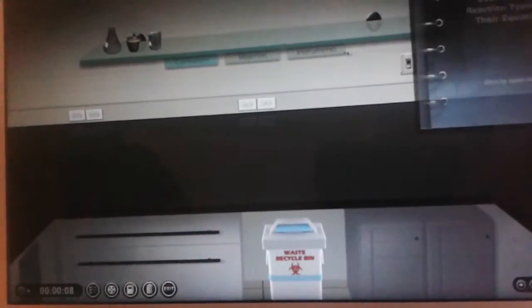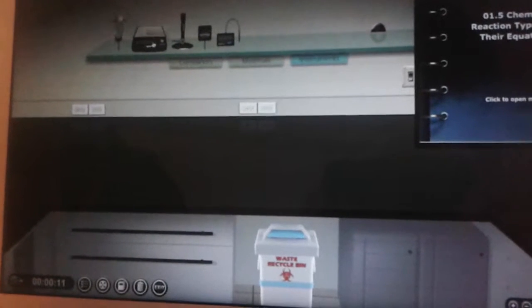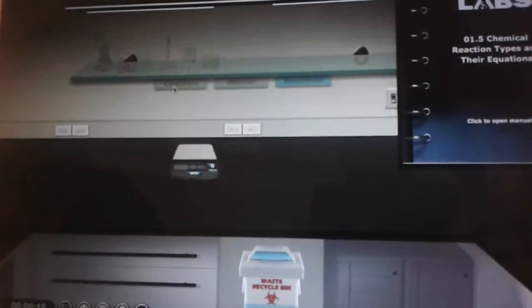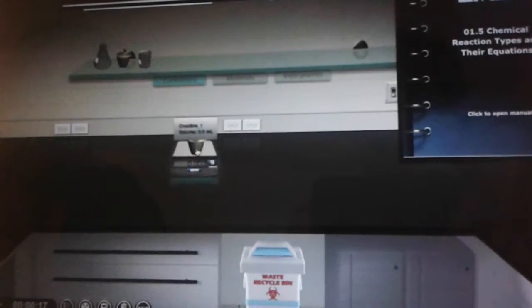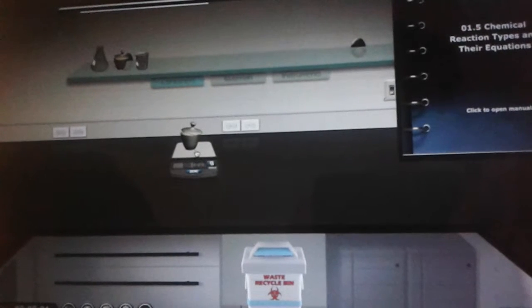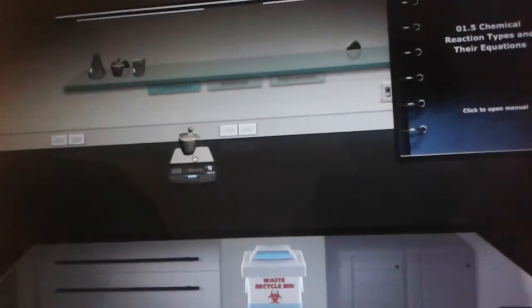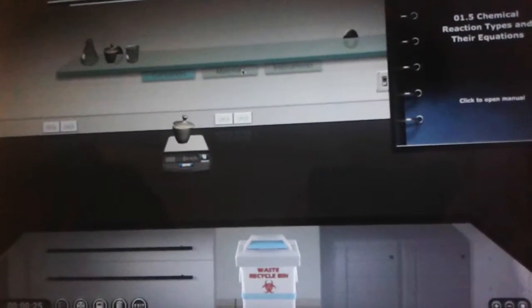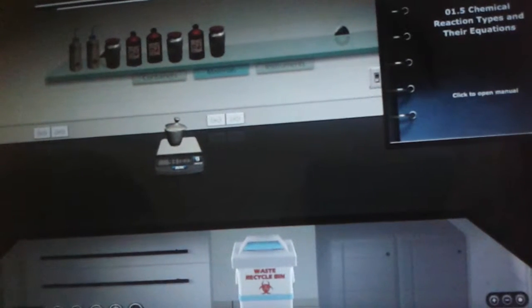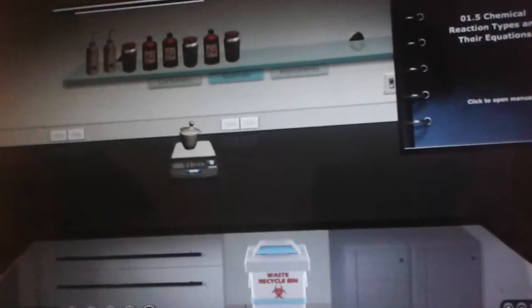To start off the experiment, we take a balance from the instrument shelf of Late Night Labs and place it on the workspace. We then place a crucible on it and weigh the mass of the crucible. The mass of the crucible was weighed as 88.000 grams. Inside the crucible, we put 5 grams of magnesium and weigh it. The resultant change in mass is 93 grams.